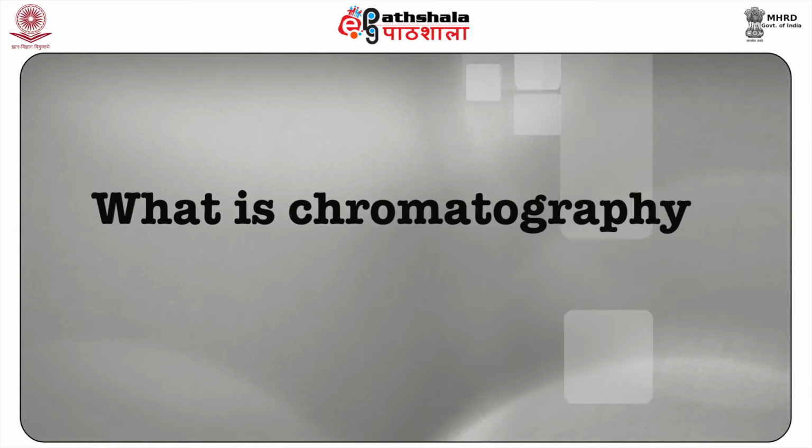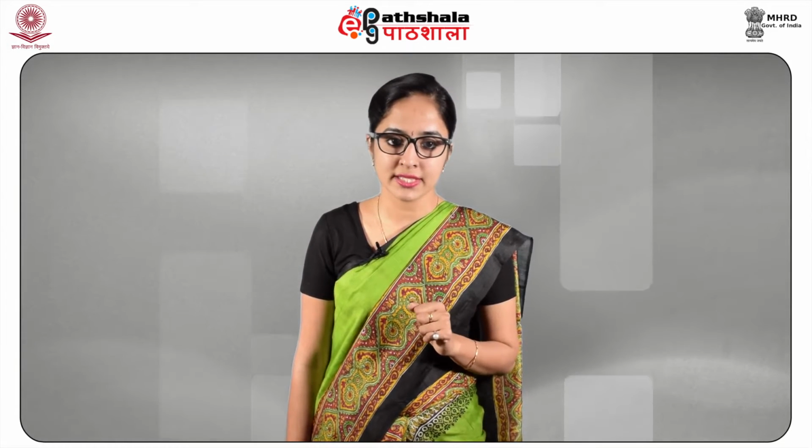So let us introduce this topic of chromatography to you first. The word chromatography comes from the Greek word chroma, which stands for color, and graphing, to write. The technique was first used around the beginning of the 20th century to separate plant pigments with easily visible colors. It has long since been possible to separate colorless compounds as long as there are methods for detecting them. So you can understand, students, how chromatography has formed the base as an important technique in the chemical world.